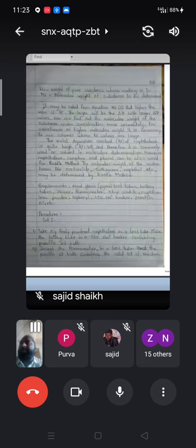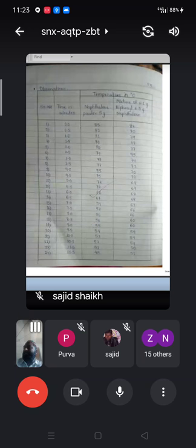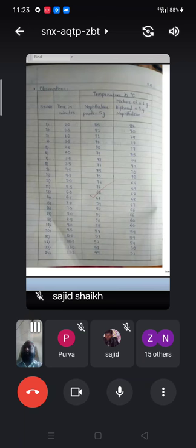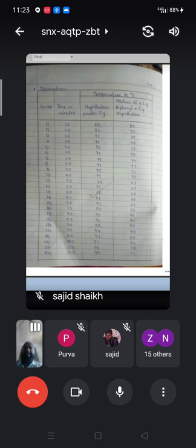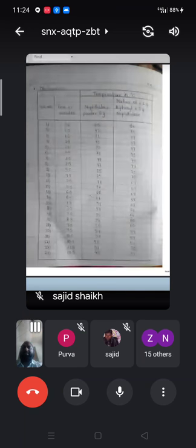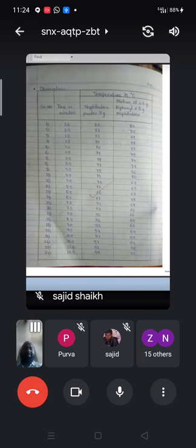In the observations, we note that 80 degrees centigrade is the melting point of naphthalene, which is why we heat to 5 degrees more, that is 85 degrees. We record the temperature after every 30 seconds, expressed in minutes: 0.5, 1, 1.5 minutes, and so on. You will observe a decrease in temperature as the solution solidifies. For Set 2, the mixture of biphenyl and naphthalene shows the highest temperature reaching about 82 degrees. You can see that the melting point has decreased due to the addition of another substance — that is the depression of the freezing point.